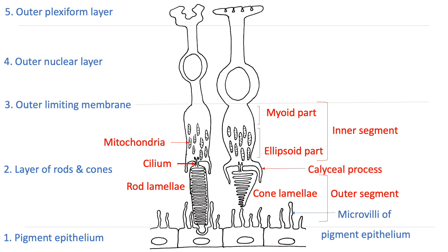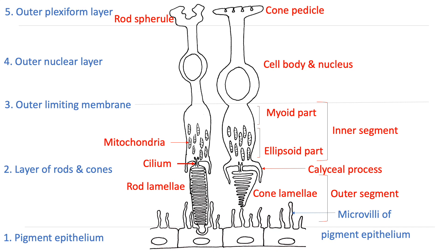In the outer nuclear layer, cell bodies and nuclei of retinal rods and cones are seen. The cone nuclei stain lightly, are larger and more oval than rod nuclei, and also have a thicker segment of cytoplasm surrounding them compared to the rod nuclei. In the outer plexiform layer, the inner processes of rods and cones are expanded to form rod spherules and cone pedicles.